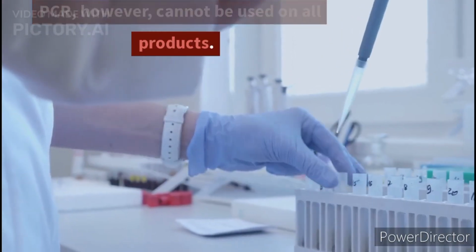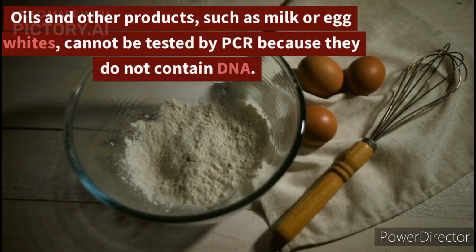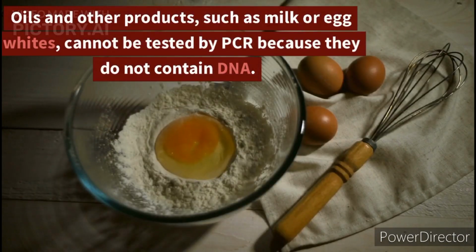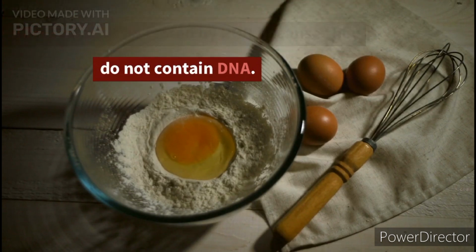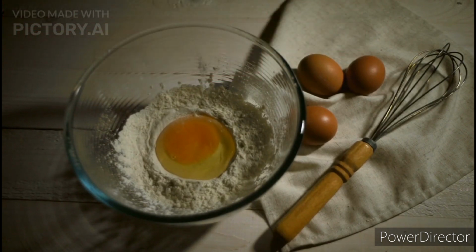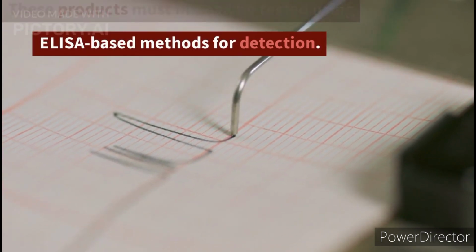PCR, however, cannot be used on all products. Oils and other products, such as milk or egg whites, cannot be tested by PCR because they do not contain DNA. These products must instead be tested using ELISA-based methods for detection.